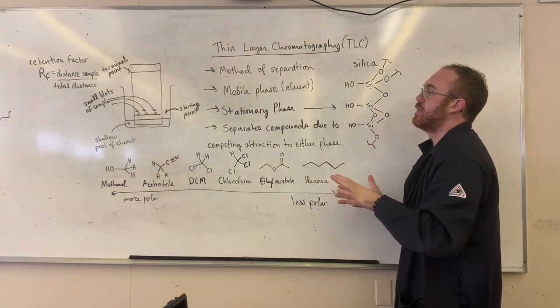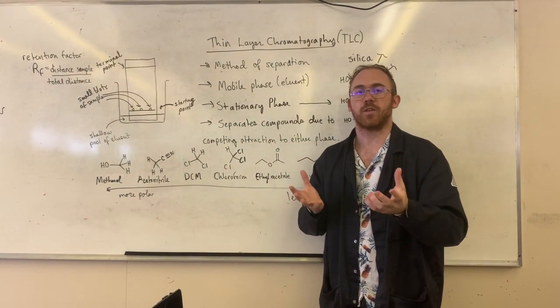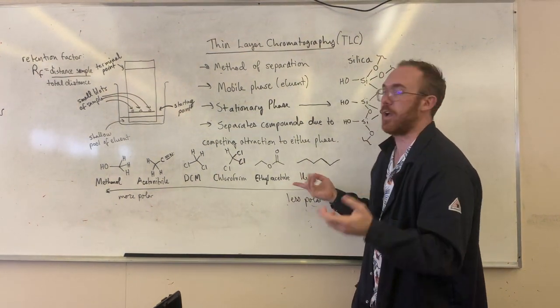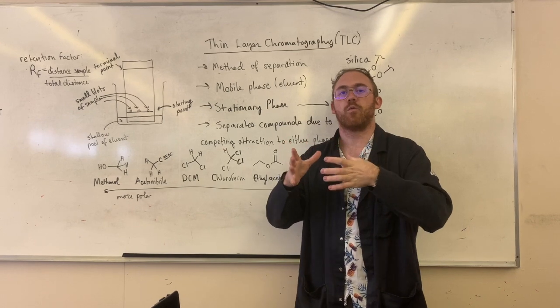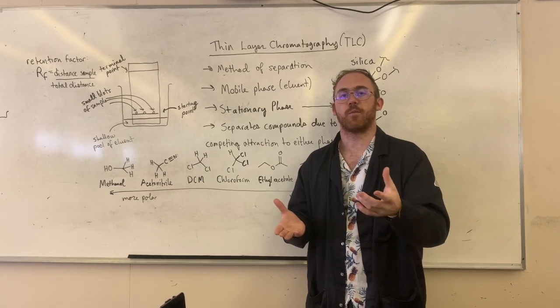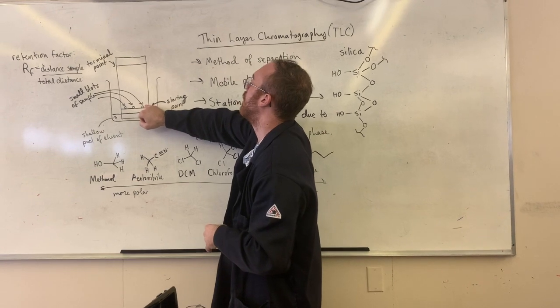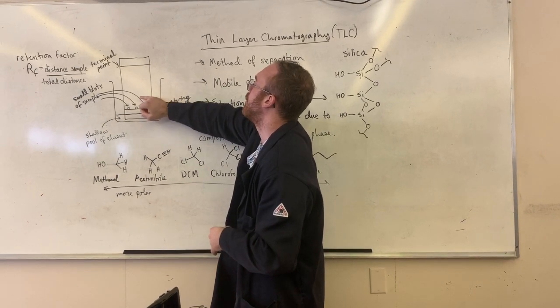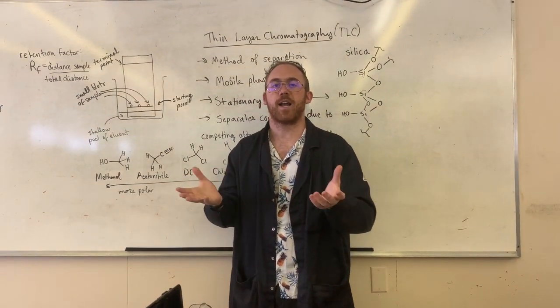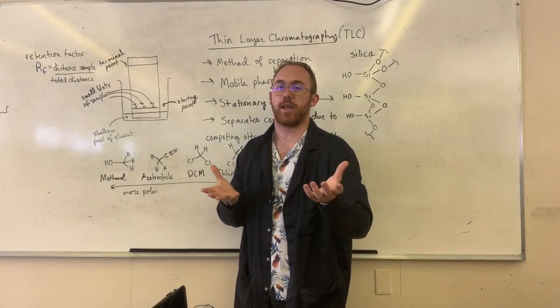So using these to separate compounds, like I said, is a very classic technique because you can actually dissolve those compounds later on in a similar mixture, like let's say of ethyl acetate and hexane again, and move them through what we call a column, or basically a silica column chromatography experiment, where you can essentially use the information you got about how strongly these are, let's say, adhering to the surface versus moving quickly, to figure out which compounds are going to come out first in fractions that you'll collect out of the other side of a stationary phase or a column.